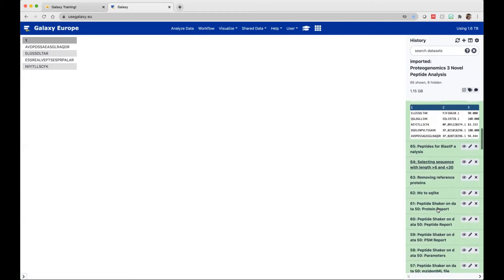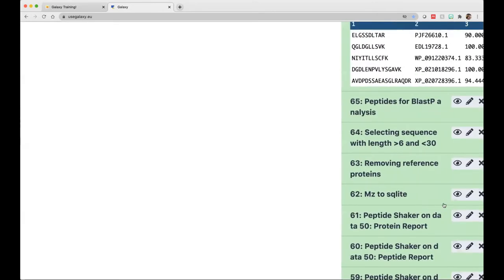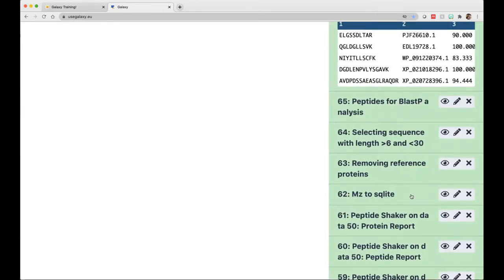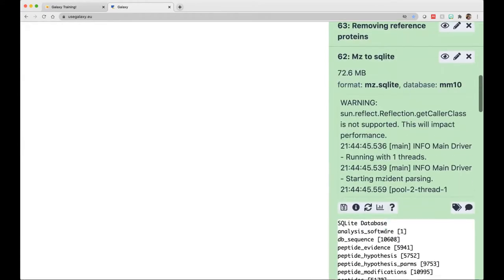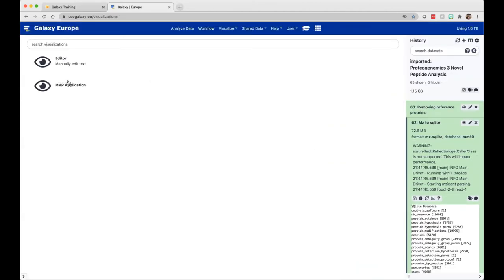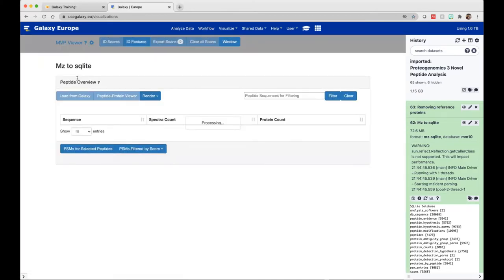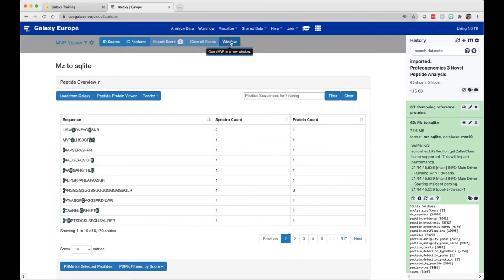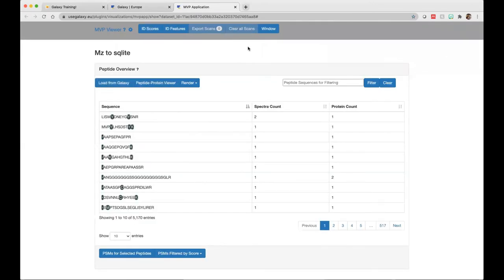For this inquisitiveness, I want to view the peptides using our multi-omics visualization platform. To open the multi-omics visualization platform, we need to select the mz2sqlite output that we get from running our second tutorial. Select on that, go to 'visualize this data,' select it, and it will give you two options: editor and MVP application. Select the MVP application and open it in a new window.